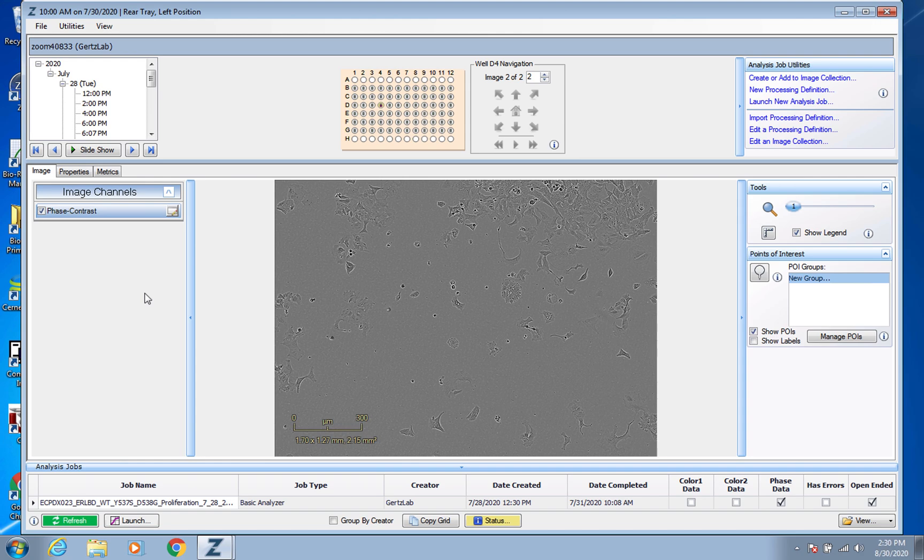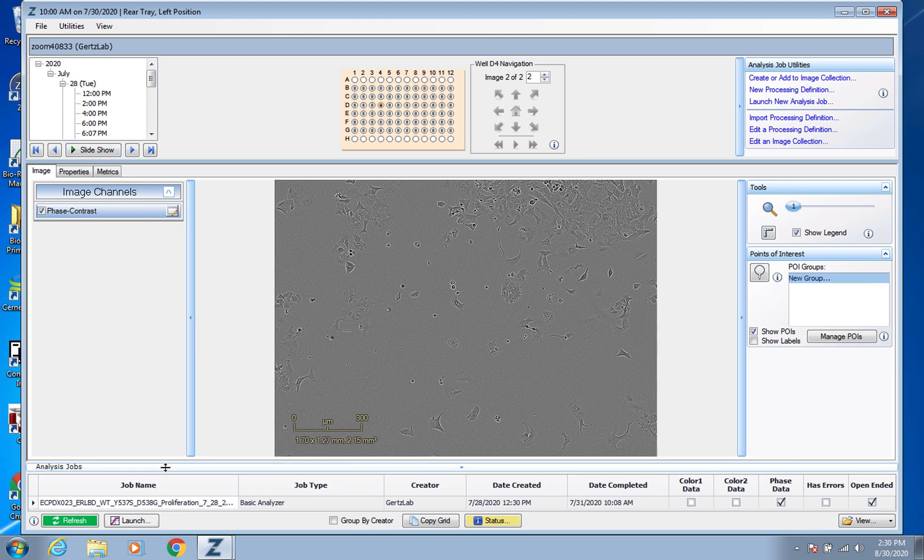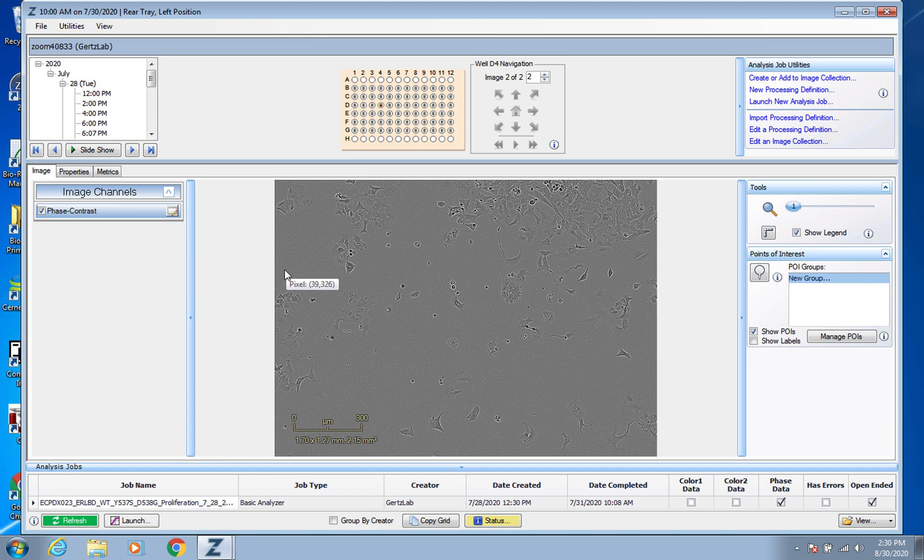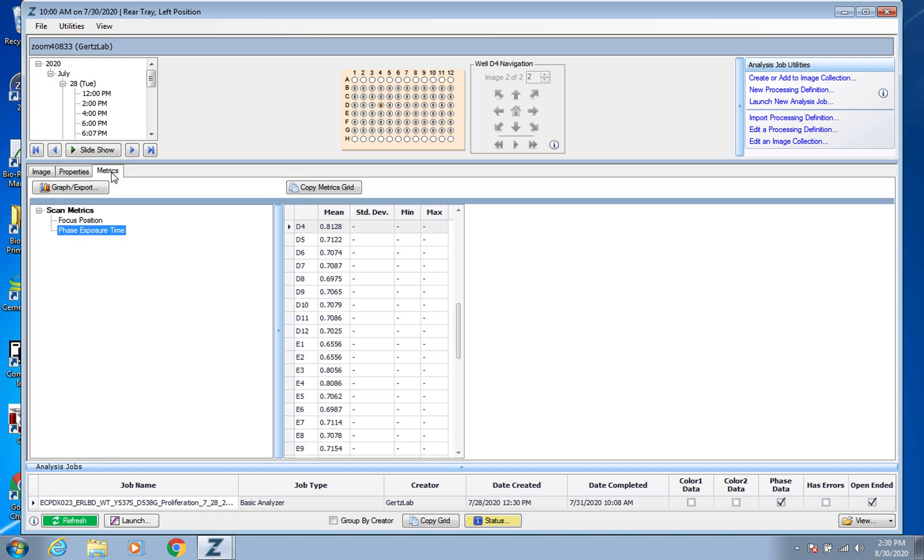Before I actually click on that, I want to point out a common mistake that people make is that they forget to actually go down here to the bottom where it says Analysis Jobs and double click on that job. They just are on this screen because the screens do look fairly similar and they go over to Metrics and export this data. This data is not the data that you want. This is just QC metrics about the machine itself and is useless to you.